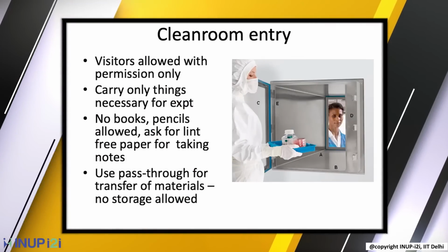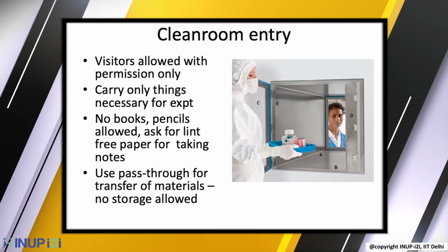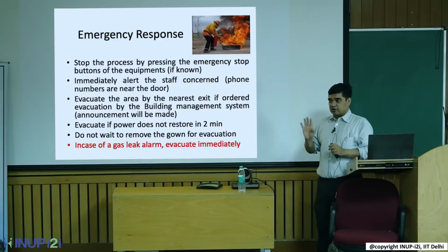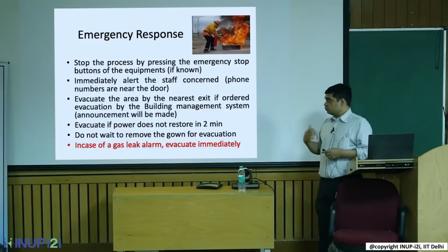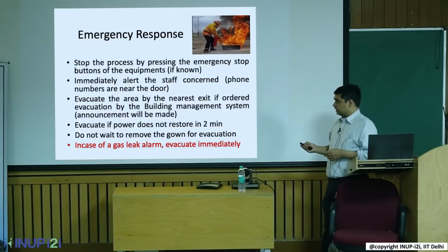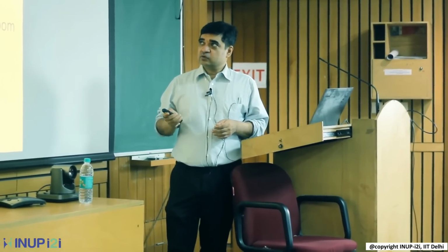Sometimes, if it's a chemical spill in some other room and everybody is evacuating, you may have time to shut down the machine. Most machines will have an emergency stop button. So press that emergency stop button if you can. And if you notice an emergency and there's no alarm, you are required to inform the clean room staff and wait for instructions, right? Okay, gas alarm is specific to PCVD.